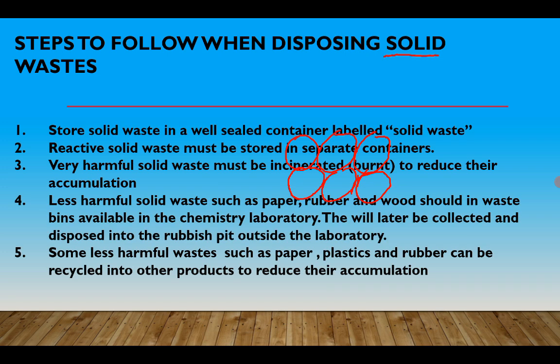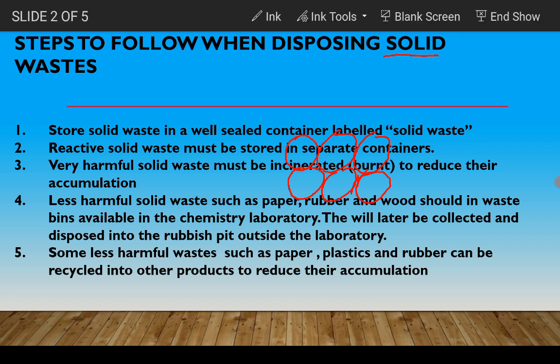When disposing of such wastes, we need to follow certain guidelines or steps. For us to successfully dispose of such wastes, when you notice that wastes are generated in your lab, first you need to have a special container which is labeled solid waste.